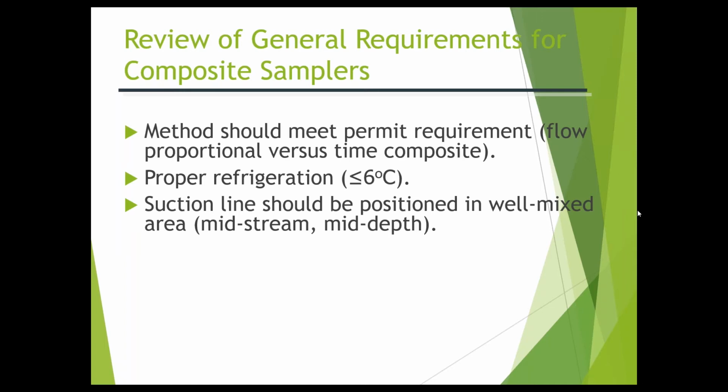Well, what does that do? That means that you are artificially trying to, on the front end, get rid of more solids, but on the back end, you're saying to your regulators, hey, I have a lot of solids here. Go ahead and fine me for exceeding my total suspended solids numbers. So do yourself a favor, midstream, mid-depth. You want all the solids to be at the bottom of the tank, away from your suction line, midstream, mid-depth, because that's going to be representative of what's going out the plant.